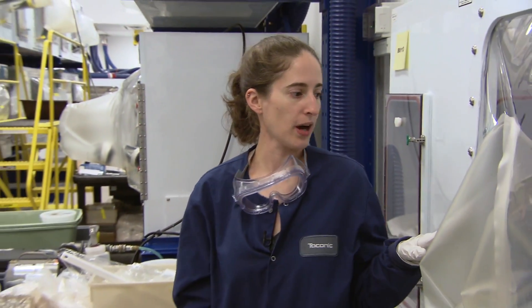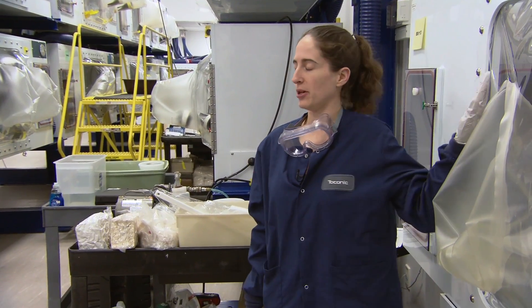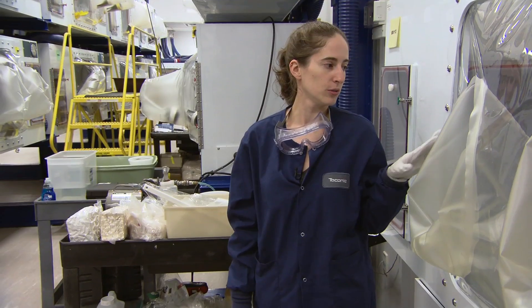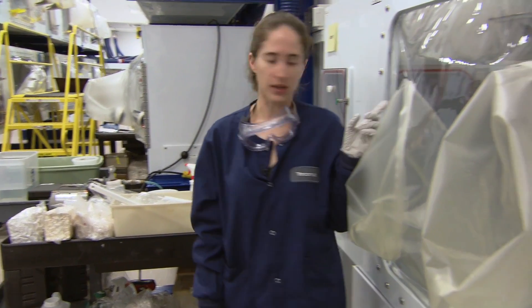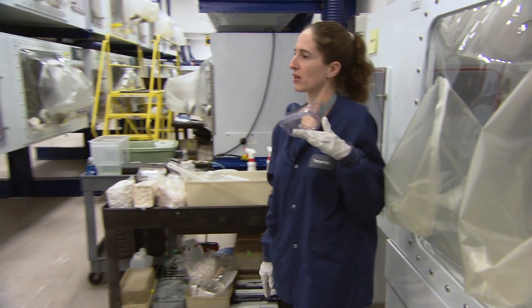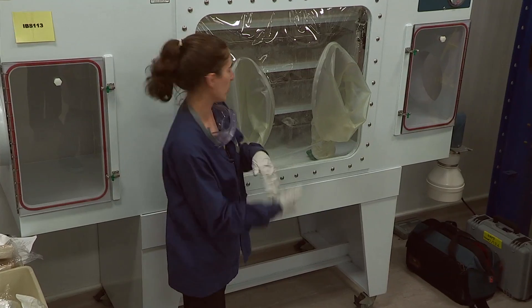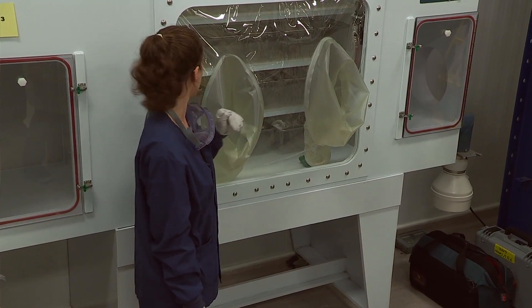When we set up an isolator for a project to help minimize the in and out of supplies, we try to put in as many supplies as we can before it's sterilized. So that includes the caging, the feeders, and because we use the hydropack, we have an adapter that goes on the cage to protect the plastic bag so the animals can't get to it and chew on it. So we would put those items in the isolator before it gets sterilized.